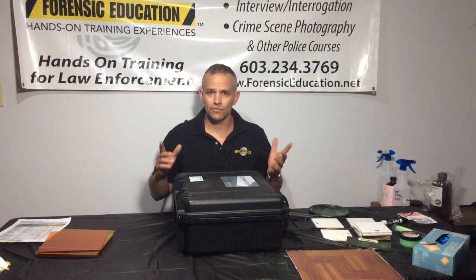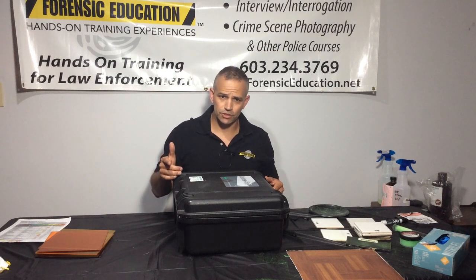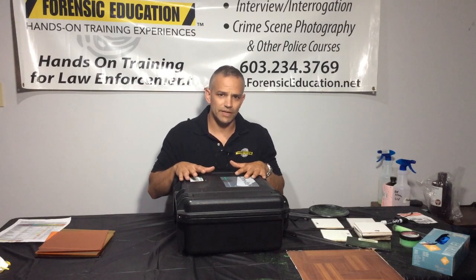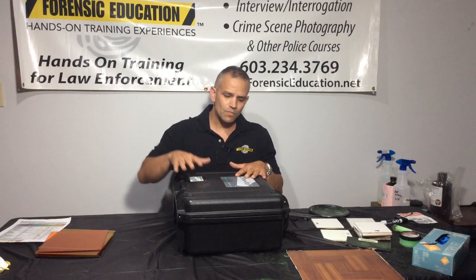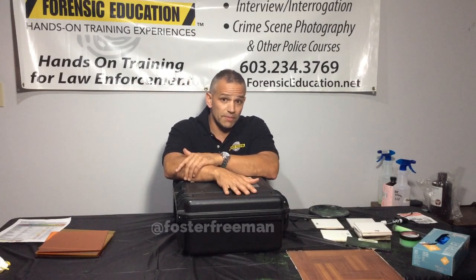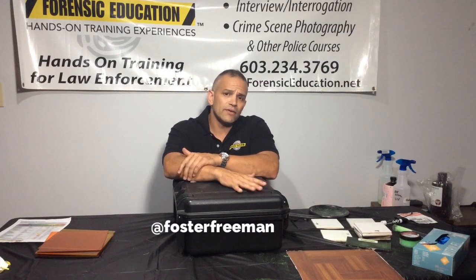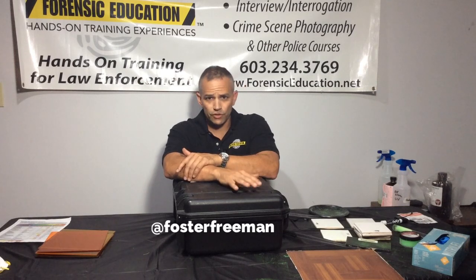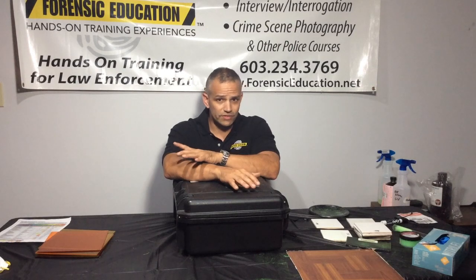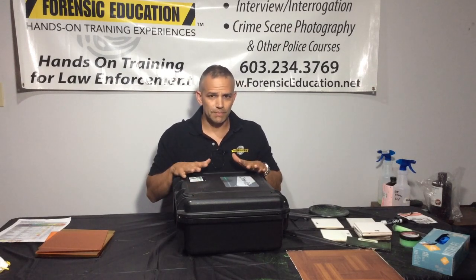Hey everyone, welcome back to Forensic Education. I'm Mike McCutcheon. I have some lights here that I am so excited to show you today. These lights were sent to me by my friend Jason Cole from Foster Freeman. These are high-end alternative light sources for forensic work, in the laboratory, or on the scene. These things are absolutely amazing.